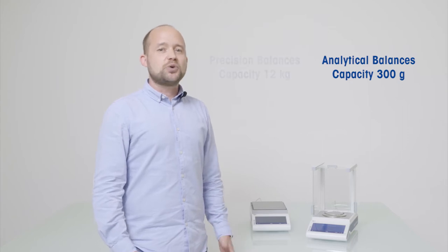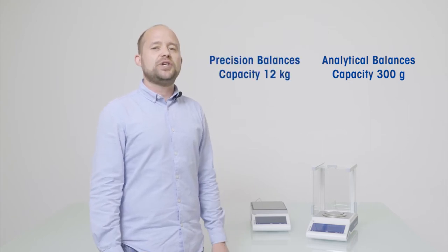Hello and welcome to our product demonstration video of Mettler Toledo MSTS Balance. MSTS laboratory balances are available both as analytical balances up to 300 g and as precision balances up to 12 kg capacity.